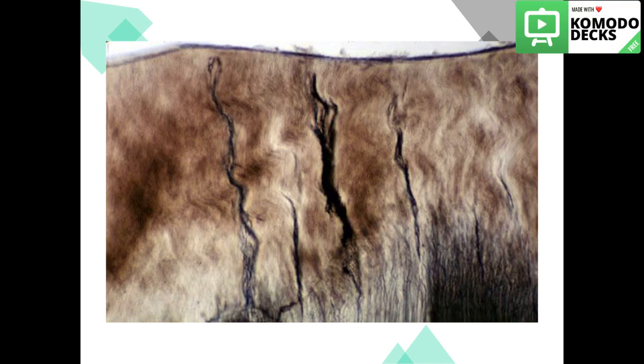Lamella is the third phenomenon we can see on the dentino enamel junction, which are hypomineralized areas that extend from the dentino enamel junction almost to the surface of enamel. They are structural faults in enamel.